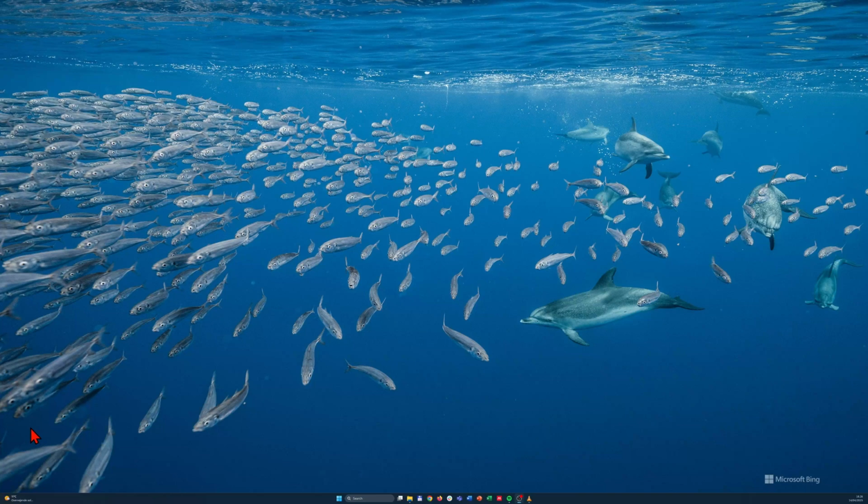Hello, today we are going to go through the basic functionality of Lightnovo Miraspec software, and I'll show you how to control the miniRaman 785 spectrometer with the Miraspec software.